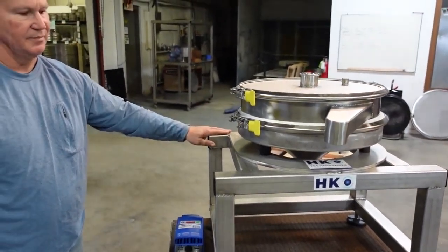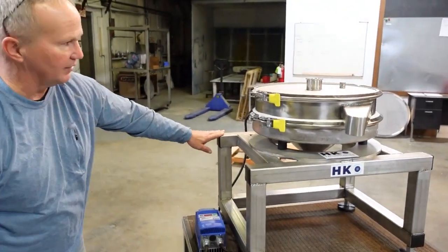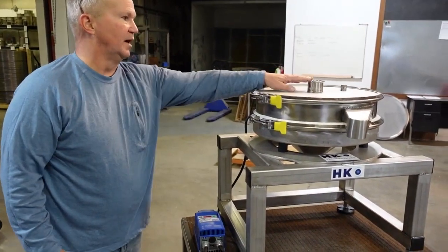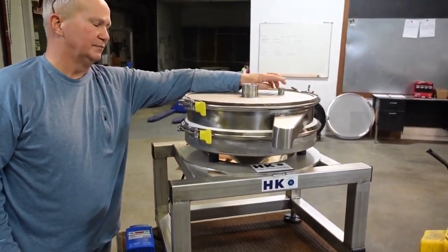The unit is mounted on a stand that's custom-built to the customer's specifications. This particular unit is relatively short. It has a cover with an inlet and another inlet for gas.